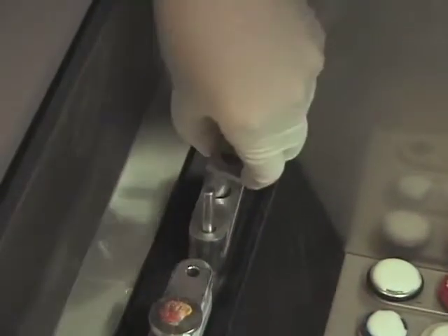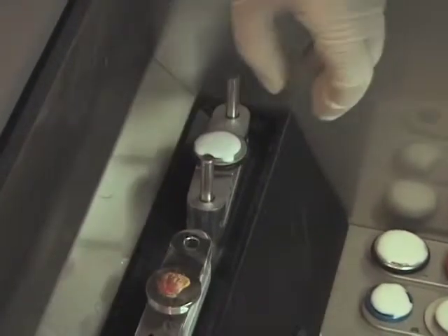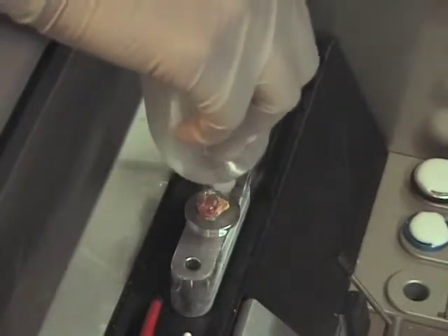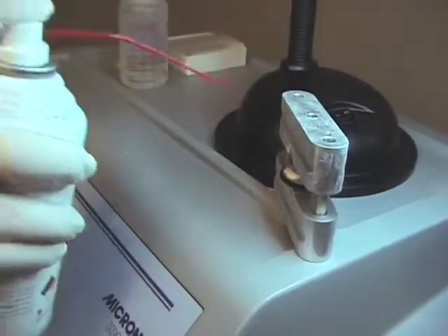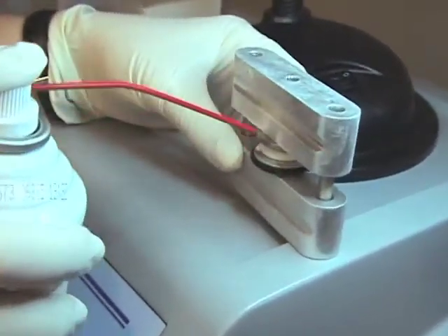This is the adapter for the Leica machine. It works with both the regular and the large Leica chucks. The cryo embedder never needs replacement parts — the same discs are used over and over again and washed clean with water. The cryo embedder's design is ergonomically friendly. The discs are rotated and the specimens embedded without movements of the hands that cause carpal tunnel, so common to people in this profession.